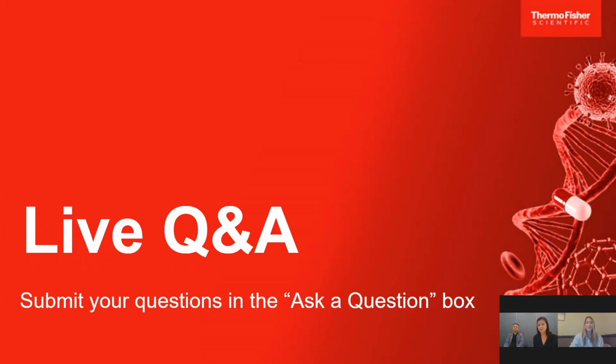Great, thank you. And another question we have here: as you mentioned, Audrey, the labeling reagent works with covalent bonds with lysine amino acids. Is there a minimum number of lysine amino acids a protein needs to have for the labeling reagent to work?